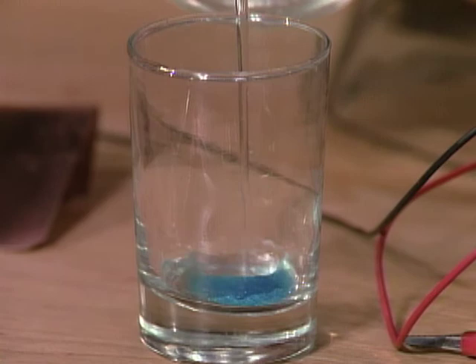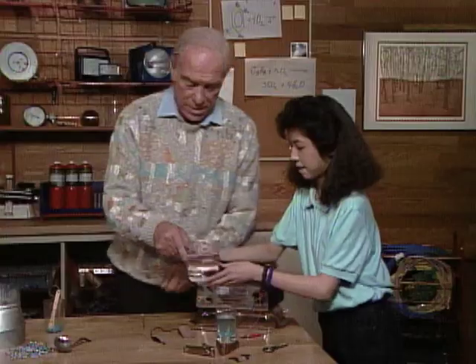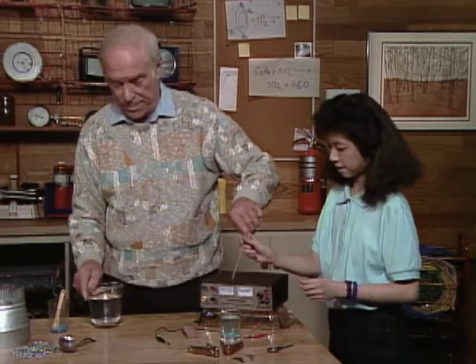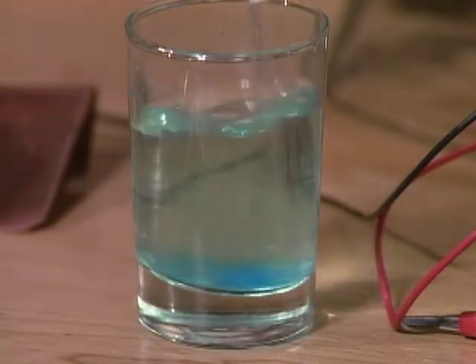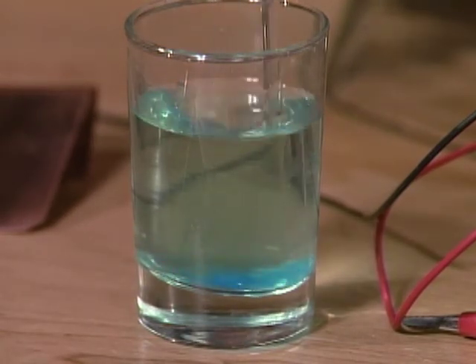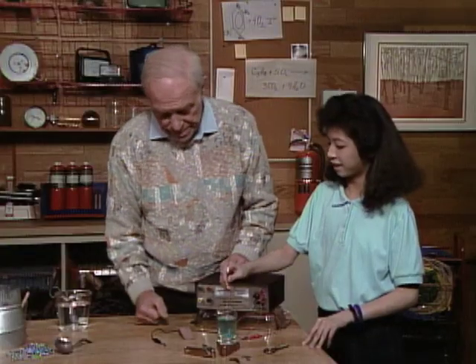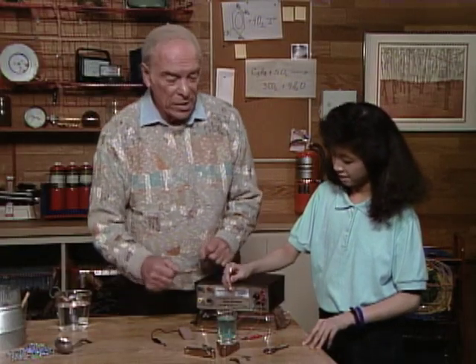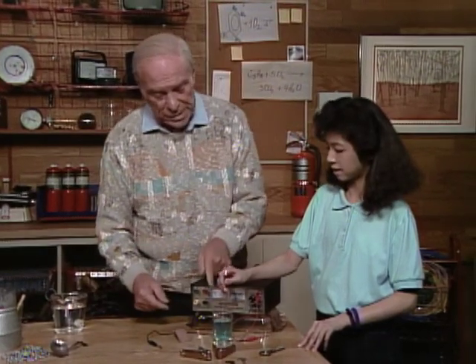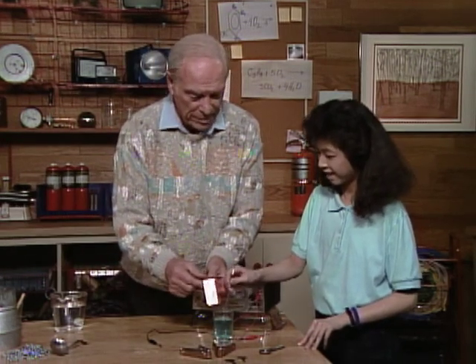Now add about enough water to fill it up about three quarters of the way. Here's a stirring rod — now stir it up. It dissolves fairly readily. What we want is a supply of copper in the solution, in the water, free to wander around. And then we need to supply copper to go into the solution after we've taken some out. And here is our supply of copper — a copper plate.